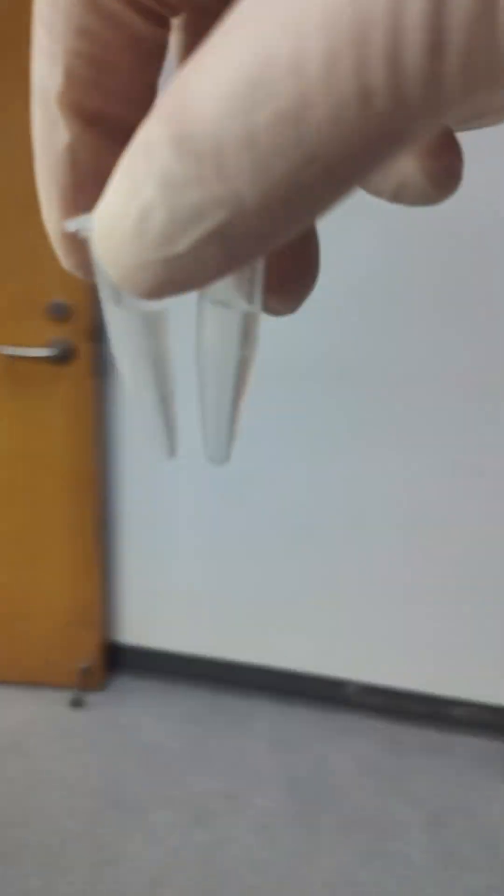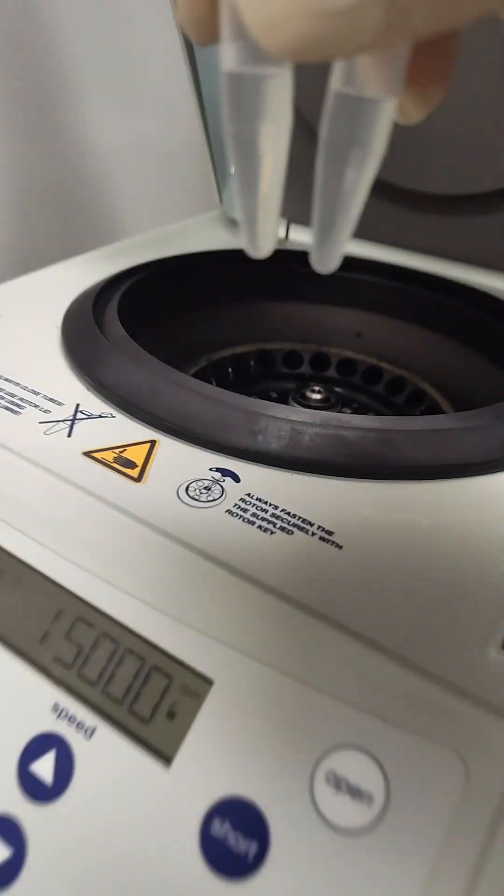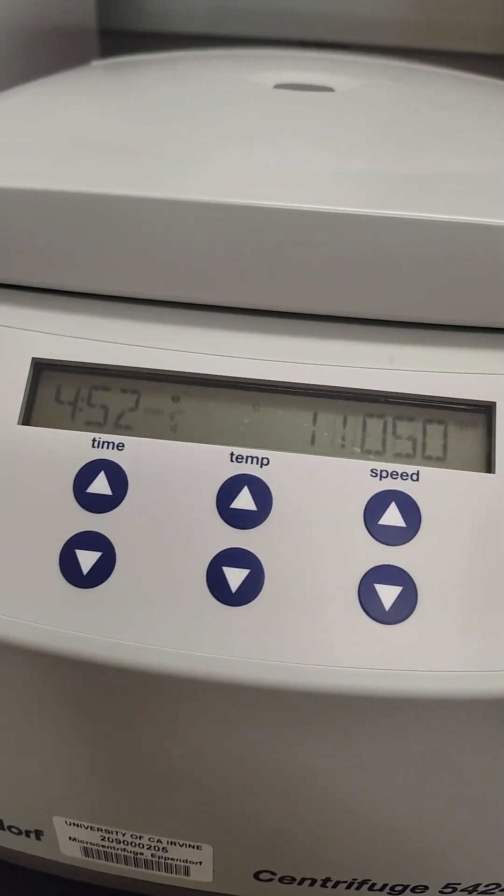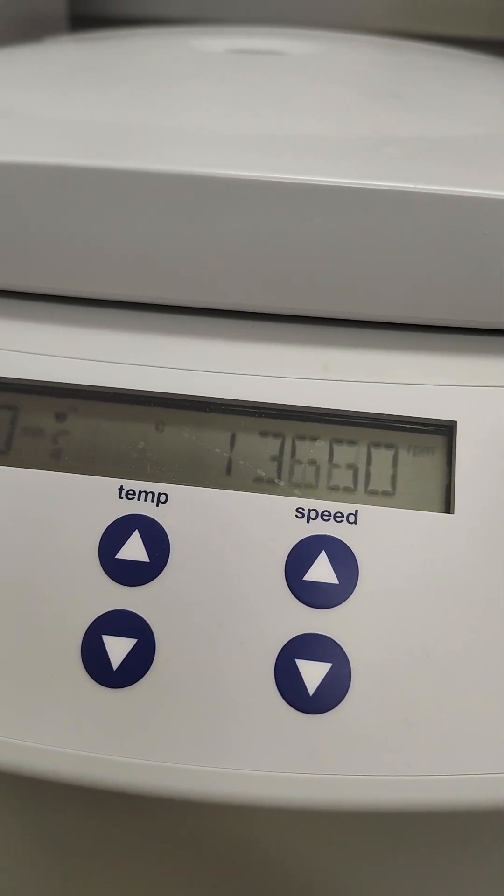Another dilution. We'll try spinning it out. A little bit more water this time. Alright then we're going to spin it out longer. Five minutes. 15,000 RPM.